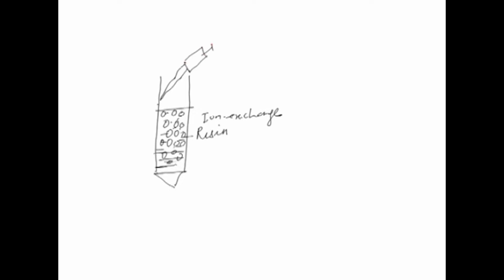In ion exchange you can have any volume of sample, as this is a displacement kind of chromatography, where the ions or ionic species will bind to the oppositely charged ion on the resin. You can even put the resin in the sample itself and let it bind in a beaker, and then load it onto the column. That can also be done.